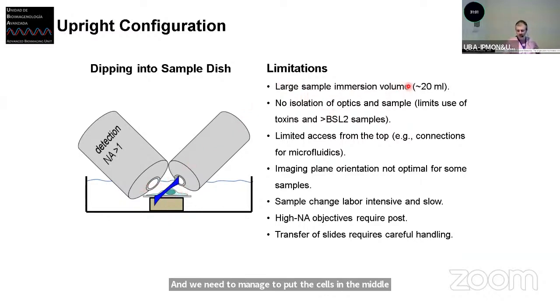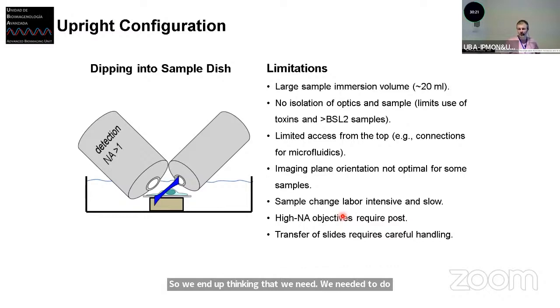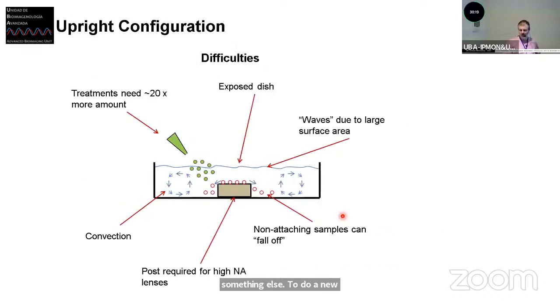We have a very large volume of immersion in order to match the index of refraction of all the different lenses. There was no isolation between the sample and the lens. And in some conditions, this is not a big deal, but in some others it is. If you have a drug or something that may not be nice to keep in contact with your lenses, or, if you want to raise the temperature, lenses usually don't want to get hot. So we ended up thinking that we needed to do something else, to do a new microscope in order to achieve all these things.